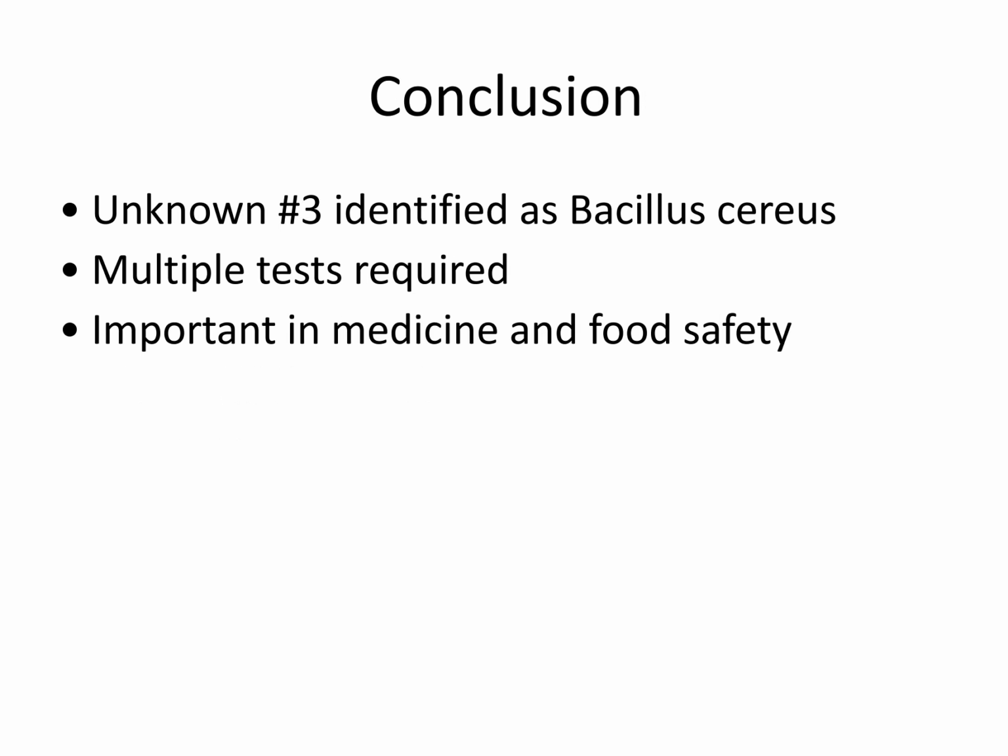So in conclusion, my unknown number 3 was identified as Bacillus cereus. Multiple tests were required to identify it, and it is important in medicine and food safety. Together, they create a biochemical profile that matched this organism.